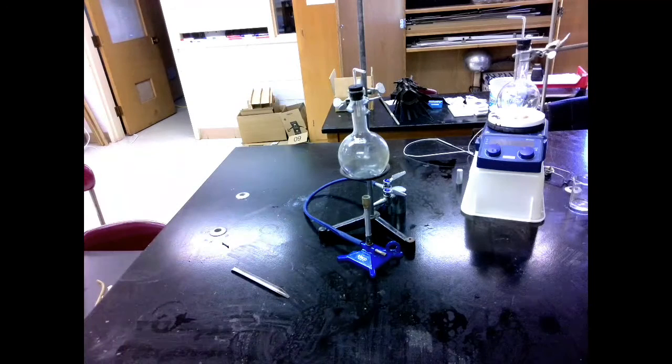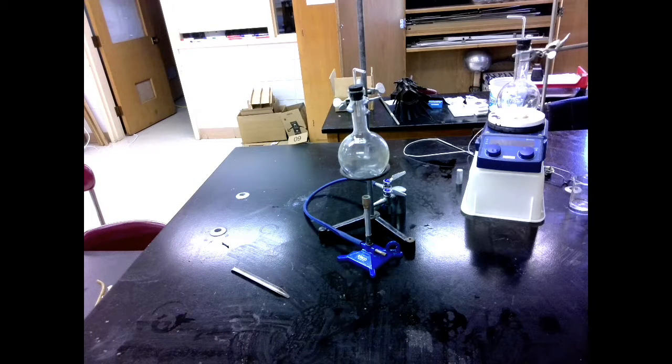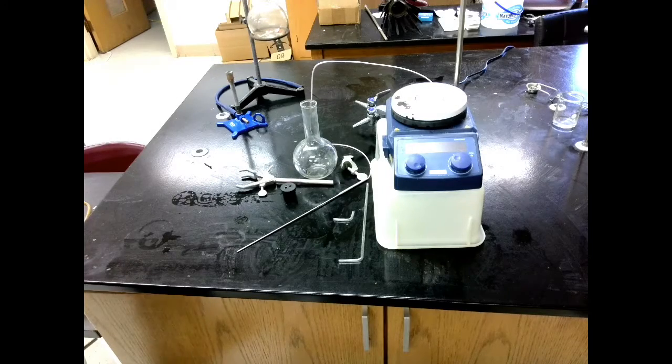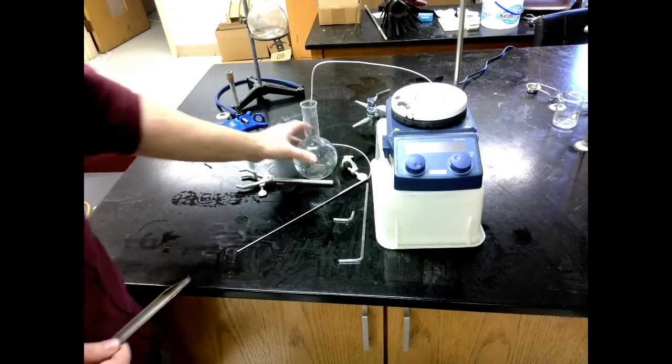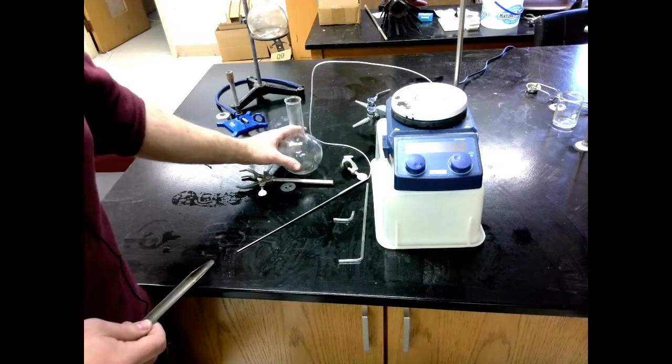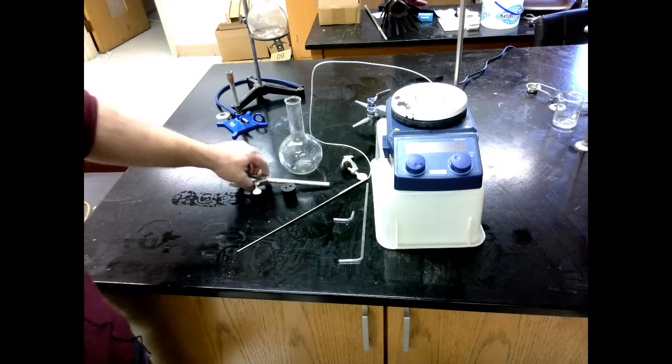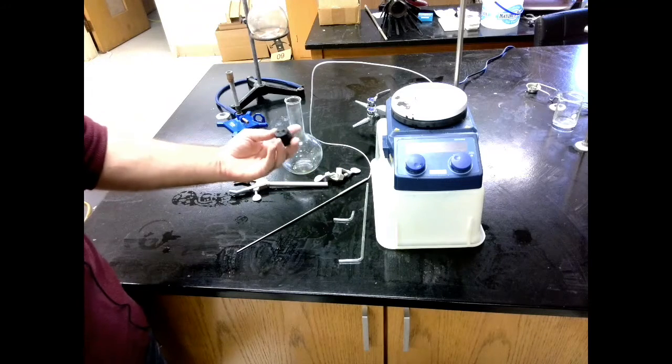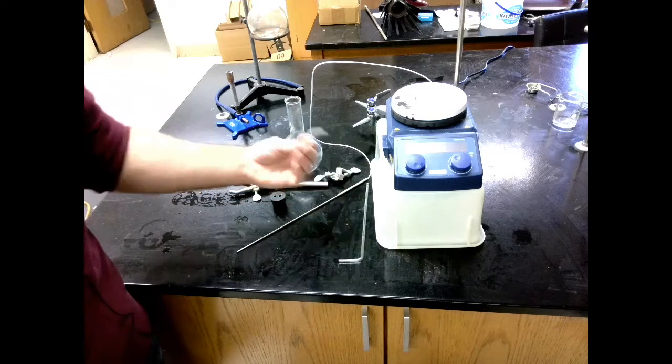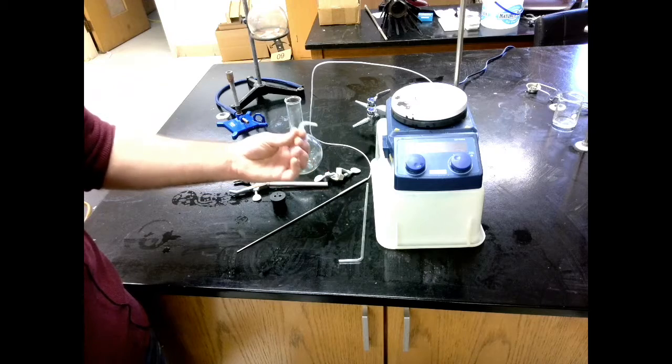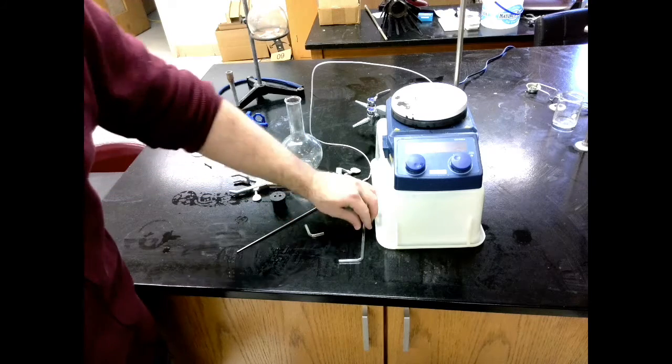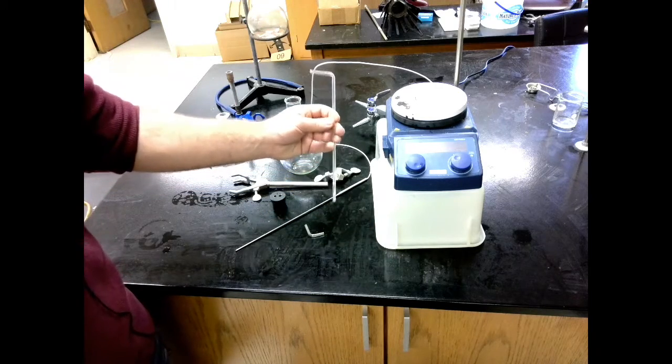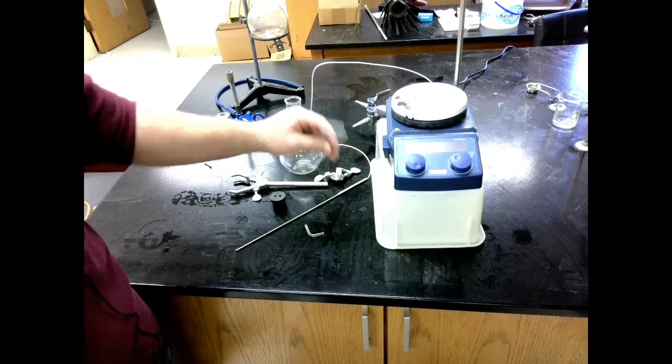Let's look at the Florence flask that will be containing our organic material. Here's our setup. We're going to need another Florence flask, another clamp, another clamp holder, another rubber stopper, another L-shaped tube that should be shorter, and a nice long glass tube. We'll look at how this should be placed in just a moment. We'll also need our hot plate.